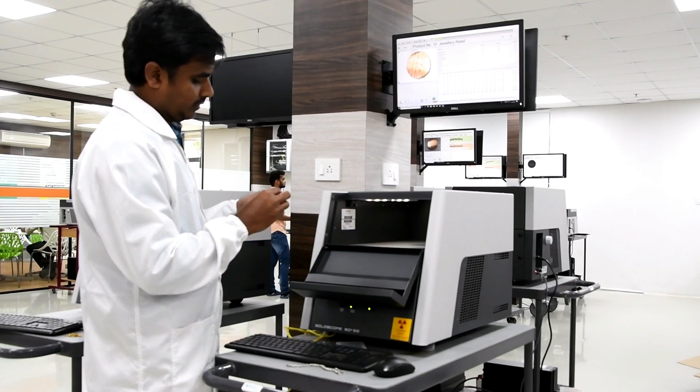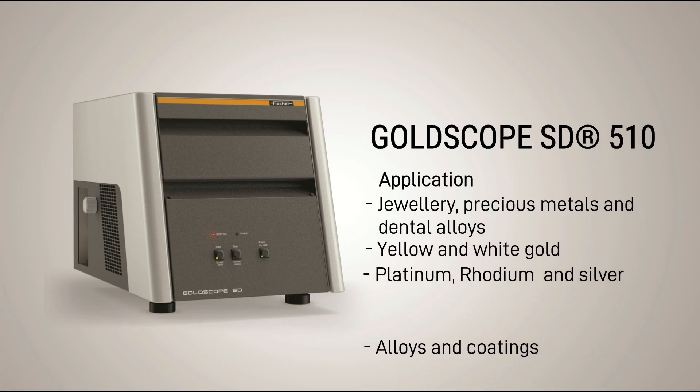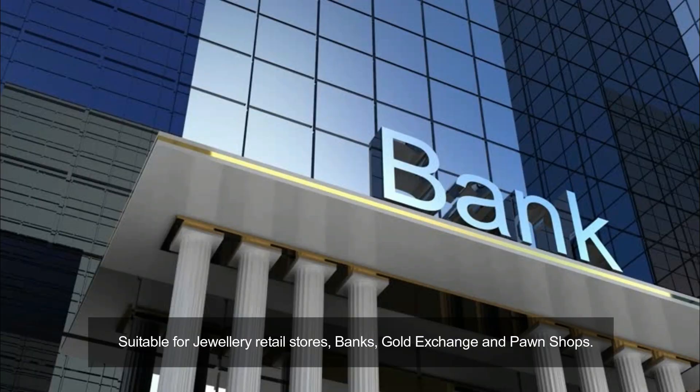The Fisher Gold testing machine has various applications such as analysis of jewelry, precious metals, dental alloys, yellow and white gold, platinum and silver, rhodium, alloys and coatings. Fisher Gold testing machines are widely used in the field of jewelry retail stores, banks, gold exchange and pawn shops.